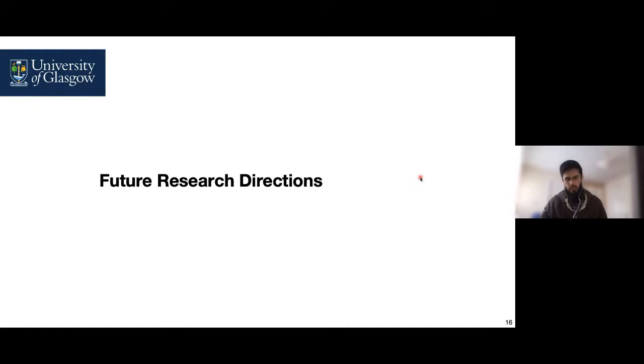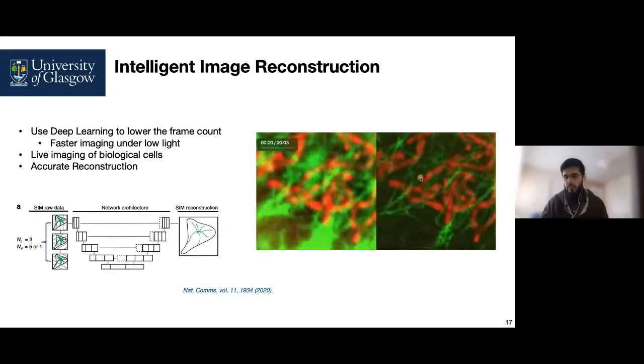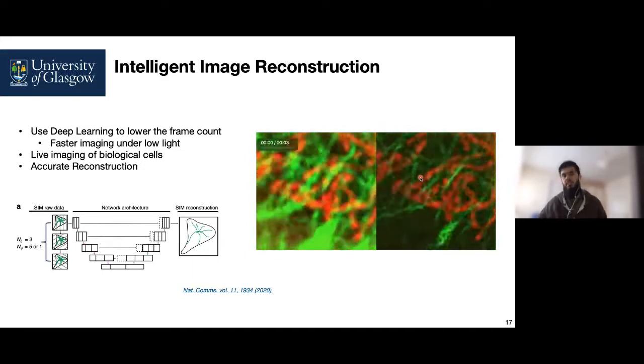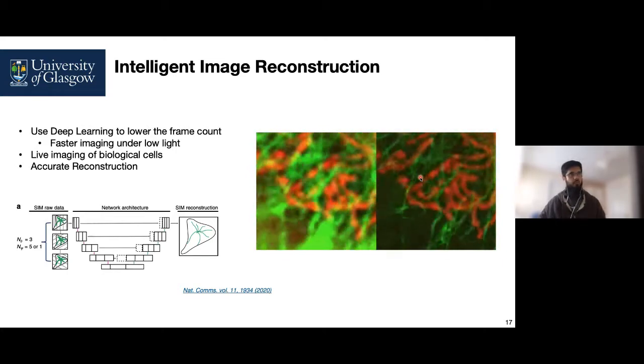Now, just to have some concluding remarks on this talk. What are the hottest topics that are currently being witnessed in the field of structured illumination microscopy? We should note that primarily the main benefit of this type of technique is the power of the reconstruction it has after we record the images.